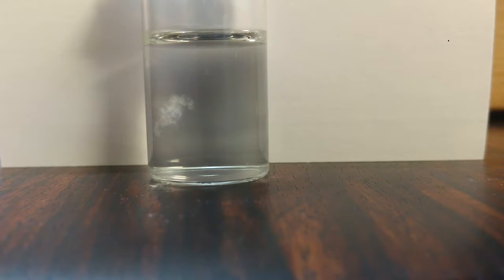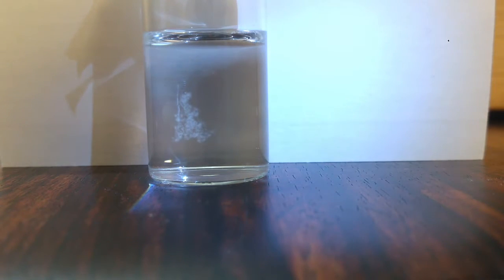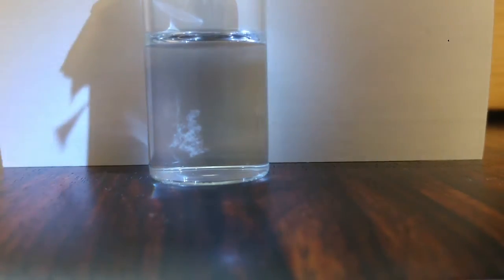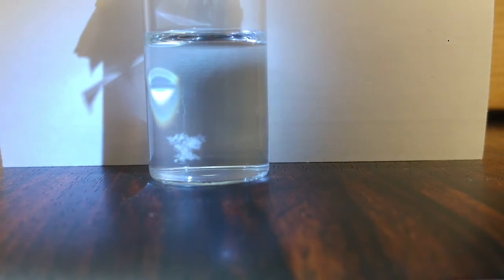Alum Crystals video 2. So today we're going to talk about the current growth in our vials, and we're going to talk about our percent yield in our experiment. So first of all, talking about current growth in our vials, as you can tell, there is some growth right there. I'm not sure if that's the process of becoming alum crystals or not, but that's what's there so far. It's not solid, it's almost like a saliva-like texture.